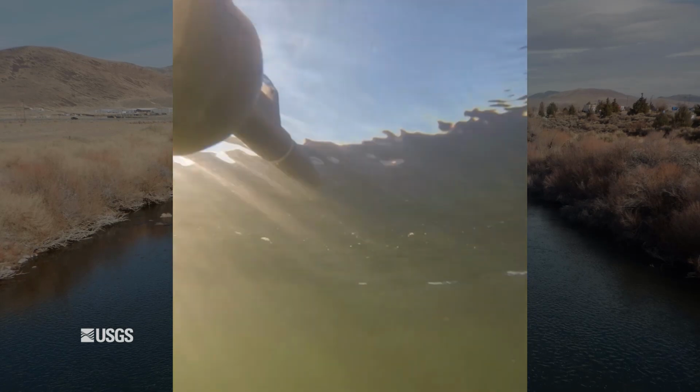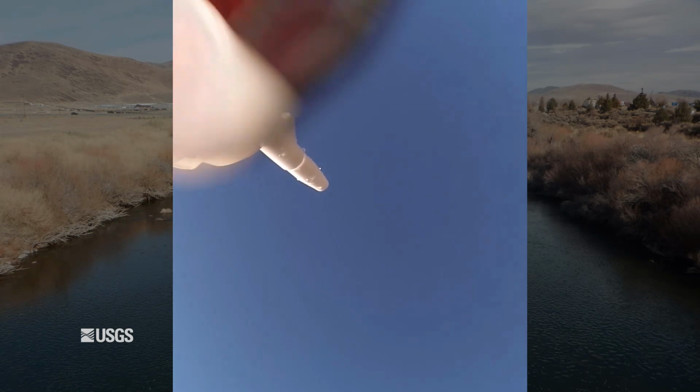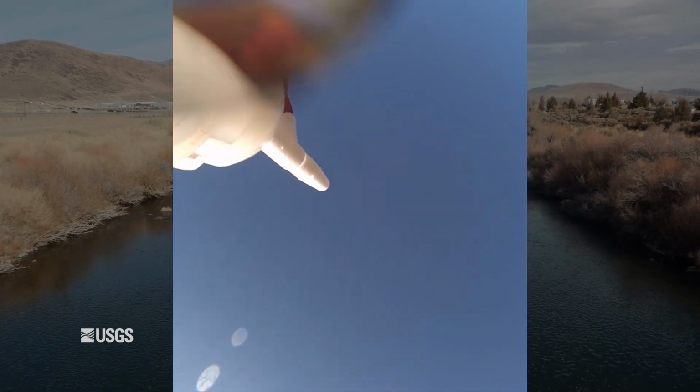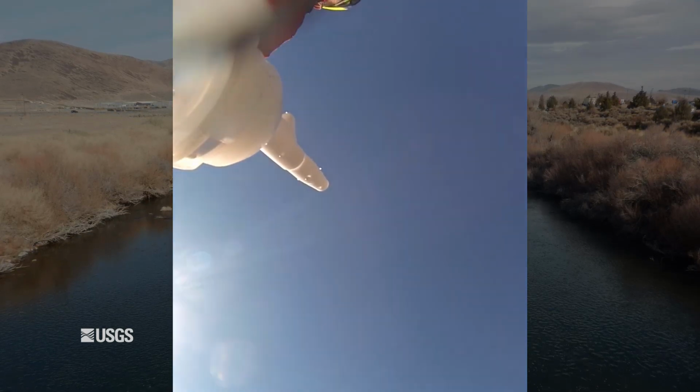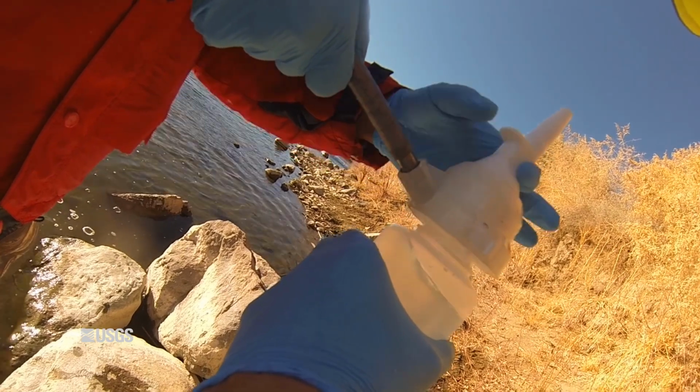This video demonstrates how the sampler vents the air while collecting the sample at one of 10 equally spaced points along the transect. After the sample is collected at the point, it is emptied into the churn. The churn is used to collect all 10 points and composite them into one sample.